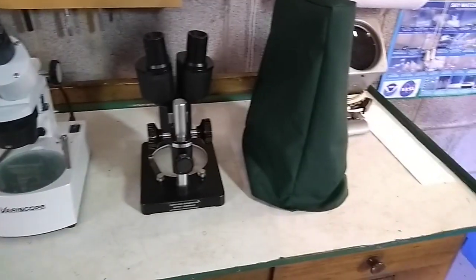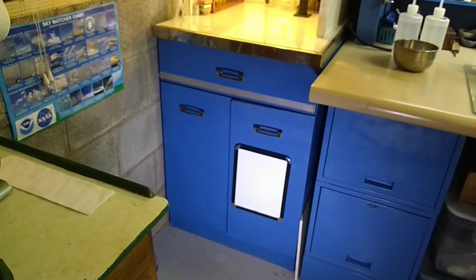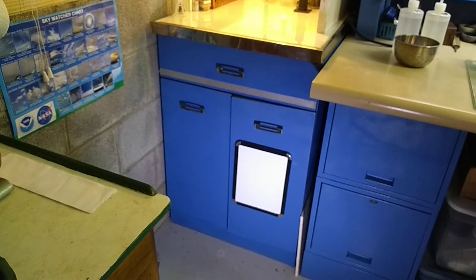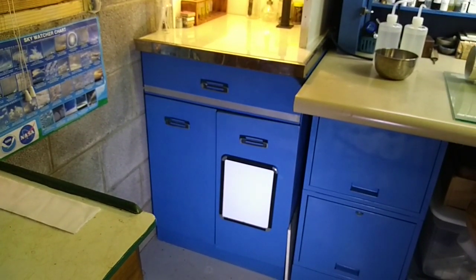We're going to move clockwise around the lab, and the next item is this cabinet. The cabinet holds the fume hood. I was looking for something of a very specific size to fit in this space. So it's kind of narrow, yet taller, because I knew I'd be standing when I'm using the fume hood. And I got it at a flea market for $5.